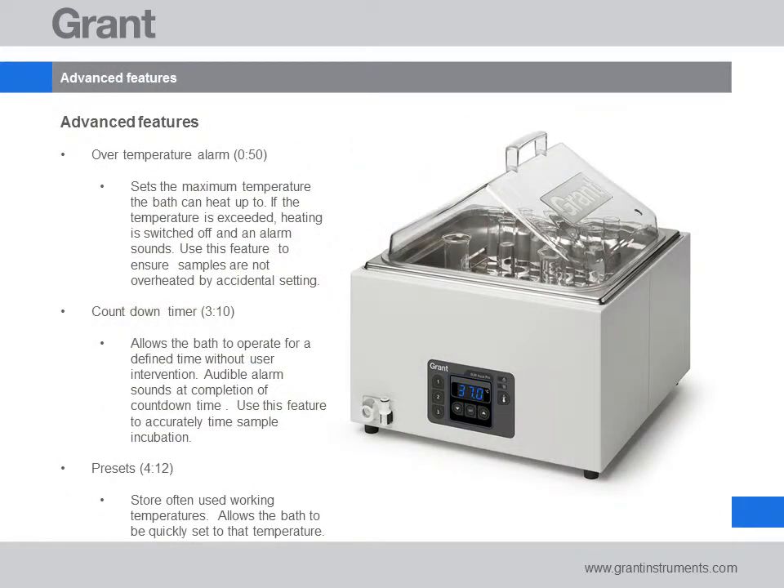The features we'll review are: the over temperature alarm, used to quickly and conveniently set an over temperature limit which will prevent samples from overheating; the countdown timer, which allows you to set a simple timer that sounds an alarm to alert you when an experiment is complete or needs to be checked; and temperature presets, used to set commonly used working temperatures.